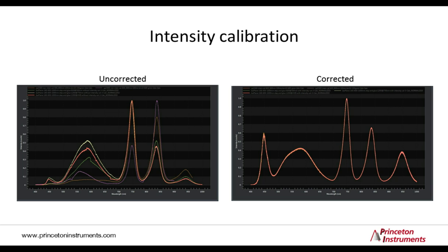But if you properly calibrate them, they can be made to look the same. Very often these days, spectrograph manufacturers have hardware as well as routines to do these things easily for the users. So you can talk to your spectrograph provider or manufacturer about that.